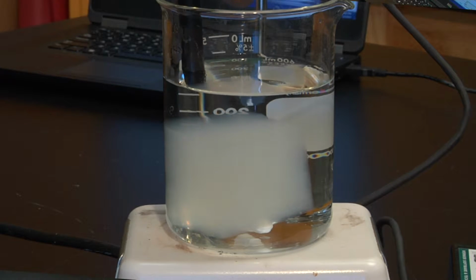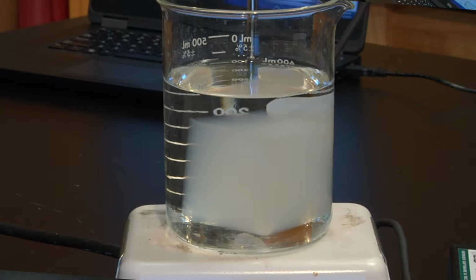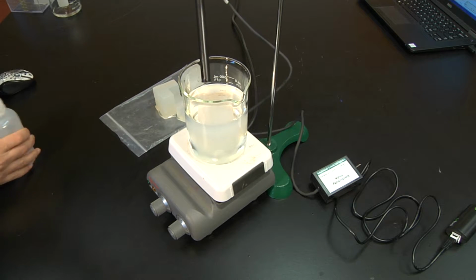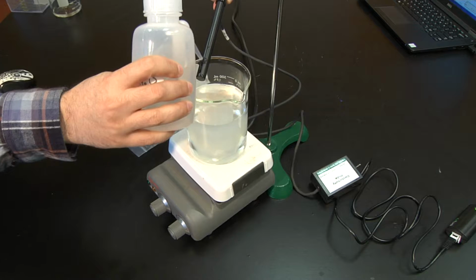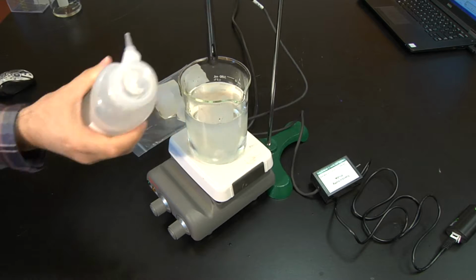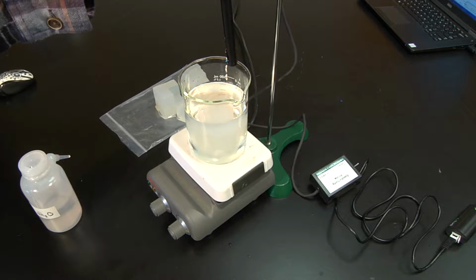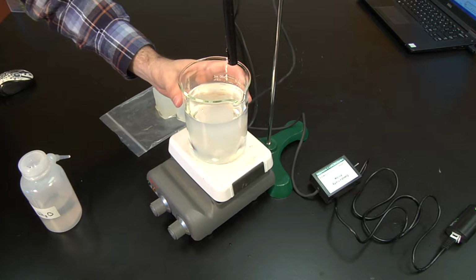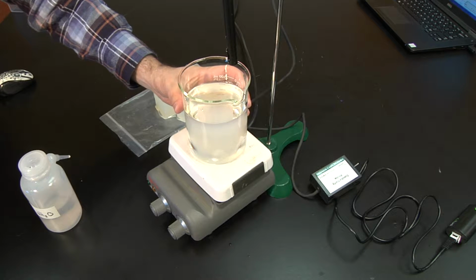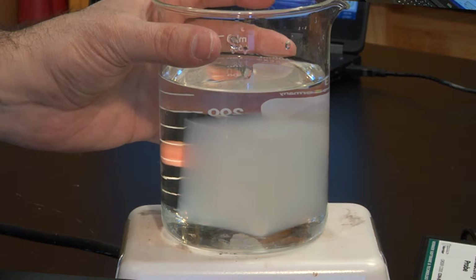I will remove the conductivity sensor. I will clean it up using distilled water in order to prevent contamination between samples. And then I'll secure it on the ring stand using the clamp again. I will dump the water and the agar cube inside the beaker, clean up the beaker, and fill it with 300 milliliters of distilled water again for the next part of the experiment.